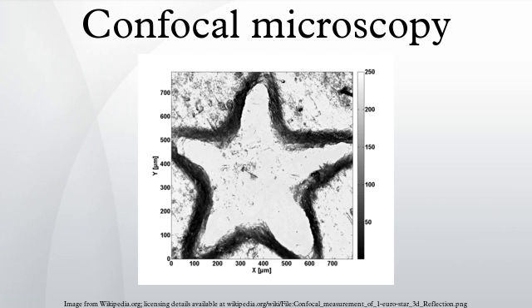The principle of confocal imaging was patented in 1957 by Marvin Minsky and aims to overcome some limitations of traditional wide-field fluorescence microscopes. In a conventional fluorescence microscope, the entire specimen is flooded evenly in light from a light source. All parts of the specimen in the optical path are excited at the same time, and the resulting fluorescence is detected by the microscope's photodetector or camera, including a large unfocused background part. In contrast, a confocal microscope uses point illumination and a pinhole in an optically conjugate plane in front of the detector to eliminate out-of-focus signal. The name confocal stems from this configuration.